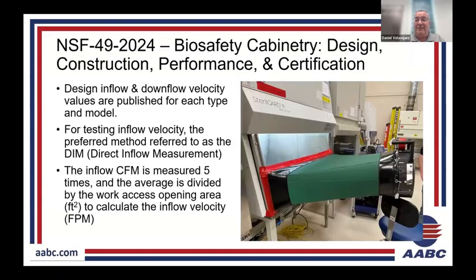This is always one that gets them. So this should have been a poll question. I unfortunately didn't make it a poll question, but certifiers will use the flow hood for testing the inflow of a biosafety cabinet.